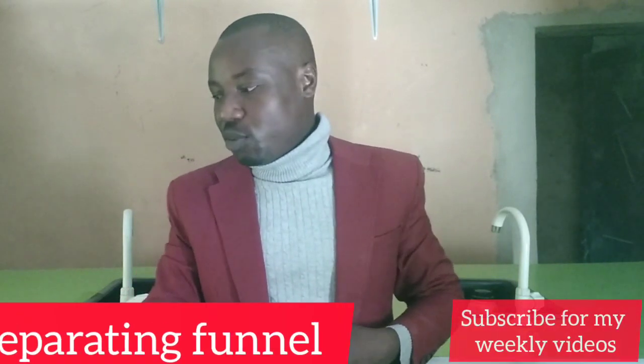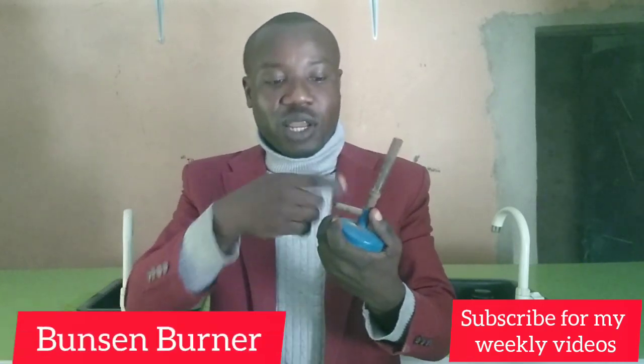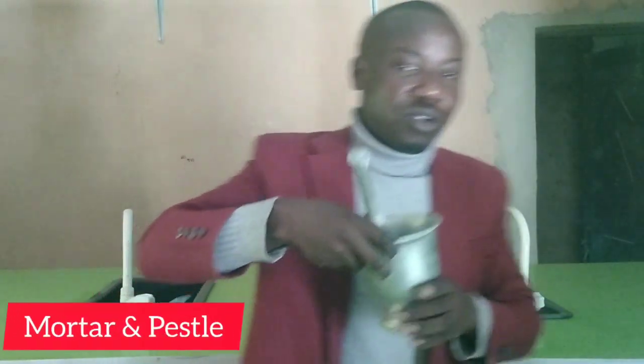Now let's proceed. I'll be showing you Bunsen burner. So this is what we call Bunsen burner. Although we have to connect other means, guys, your gas, you have to connect it from there, the light, you get your fire. This is what we call mortar and pestle. Mortar and pestle, this is it. This is a mortar, this is a pestle. So that is, we use it for crushing. So if I want to do crushing in the lab, that's what we use for that.